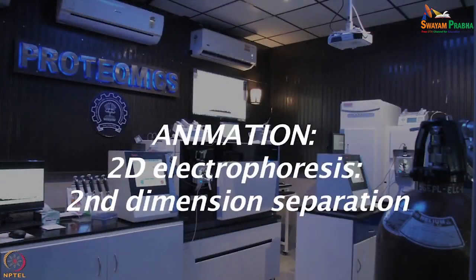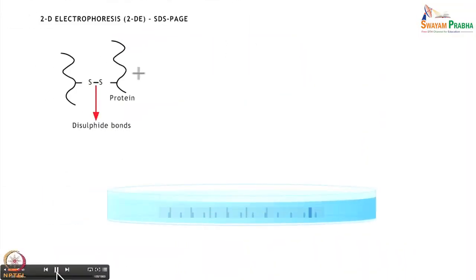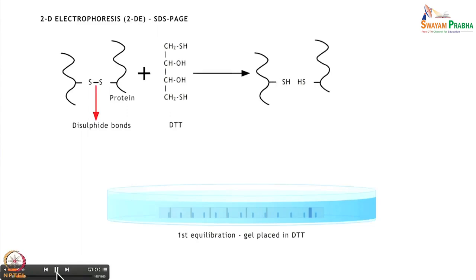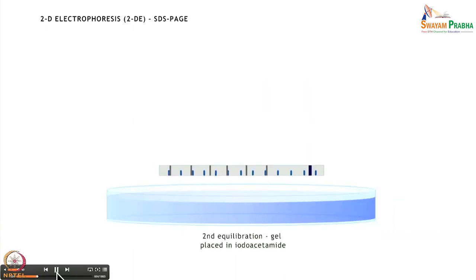Let us watch the following animation to understand this concept better. The IPG strip is equilibrated in a reducing agent like DTT, followed by an alkylating agent, iodoacetamide, which prevents reformation of the reduced bonds.